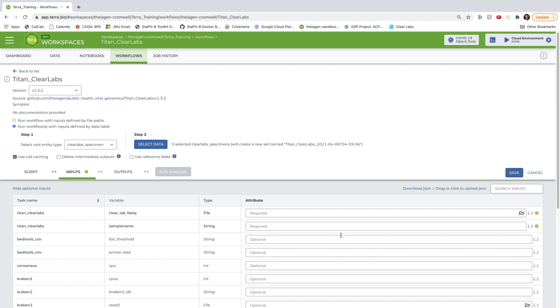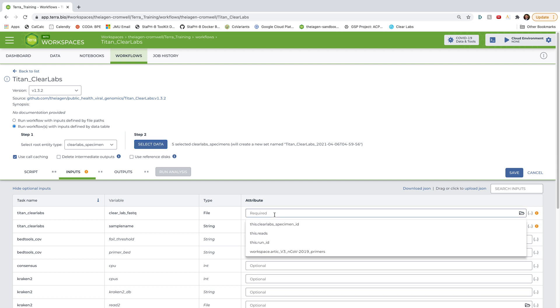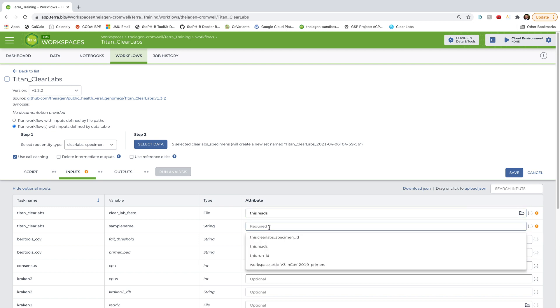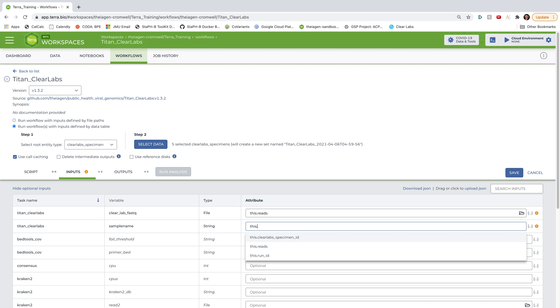OK, so for the Clear Lab fast queue, I'm going to type this dot reads to indicate that the reads column of our Clear Labs specimen table contains paths to our read data that we want analyzed. And for a sample name, I'm going to type this dot Clear Labs specimen ID to indicate that the Clear Labs specimen ID column, i.e. the first column in the Clear Labs specimen table contains this sample name for each sample being analyzed.